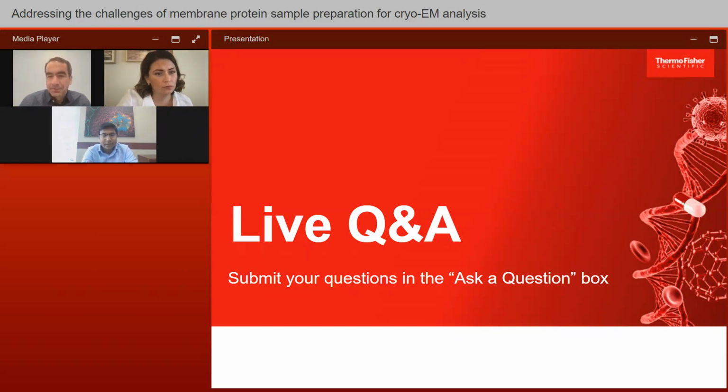I like this question because I have a feeling that all three of us will answer this question differently. So I'll ask it, and thankfully I don't actually have to answer it. The premise of this question is I would like to know how essential detergent exchange is during purification. I'll ask this maybe to you, Rosie, first, and then to Mahfuz second. In your opinion, is it a good idea to use a single detergent for both solubilization and purification?